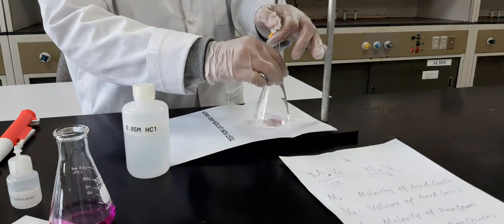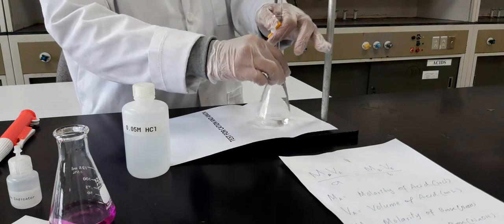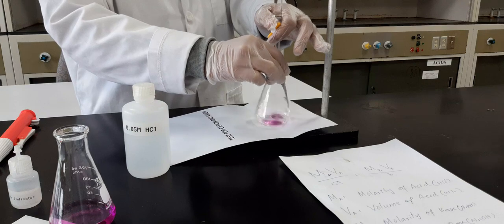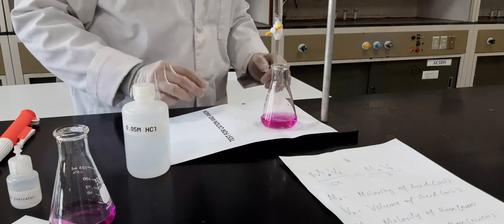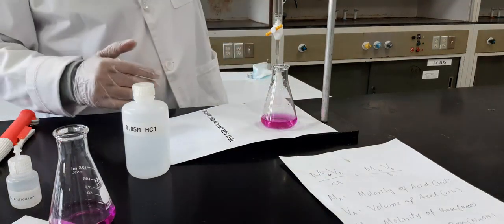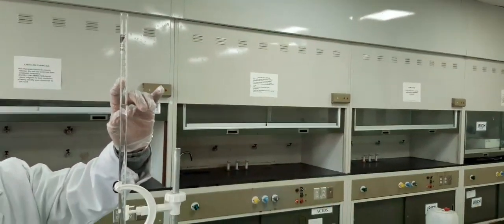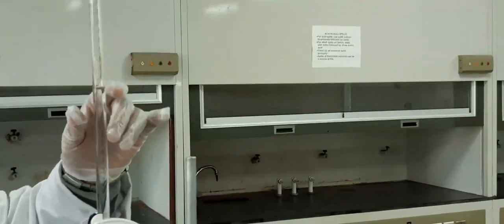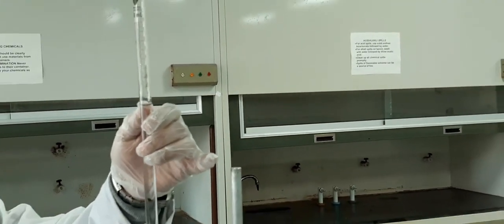So let's look, you can see it's changing to pink, but it disappears. At one point the color will be permanently pink. You can see now it's getting pink. That's it, you can see the pink color. This is your endpoint. For the first one we started from 0, if you remember, and ended at 4.5. Next, we started from 4.5 and ended at around 9.1.